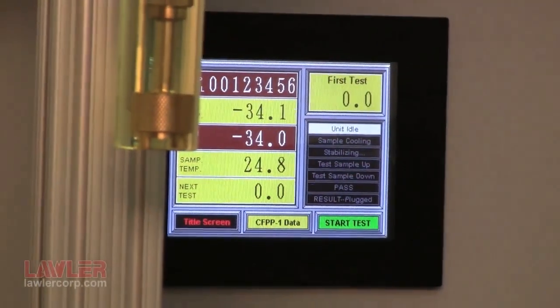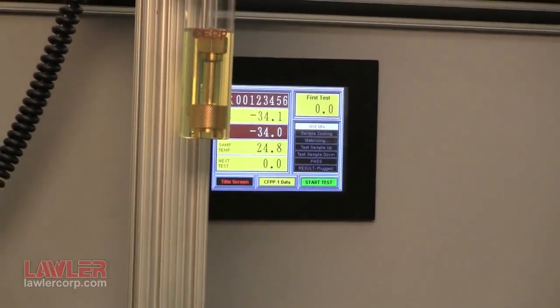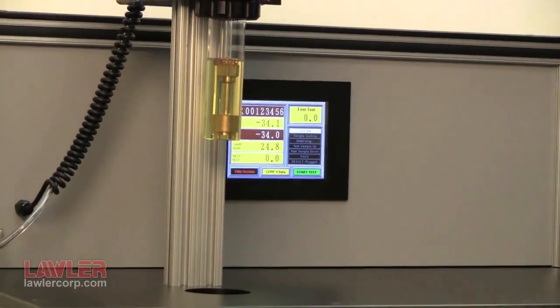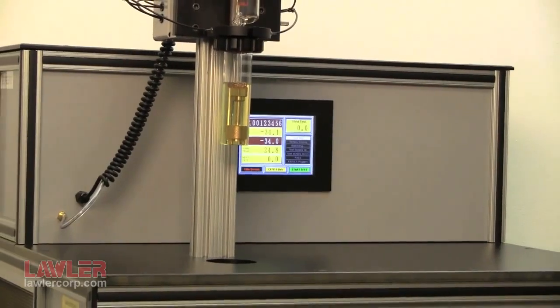This video will focus on the DR Series automated cold flow property analyzer family for cloud point, pour point, freeze point, and shown here, cold filter plug-in point.